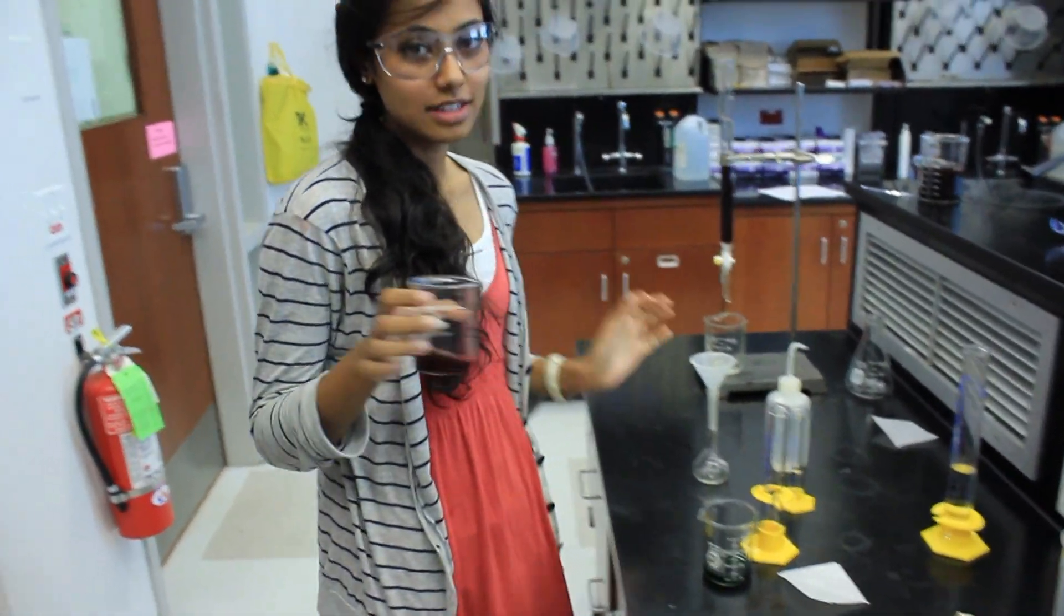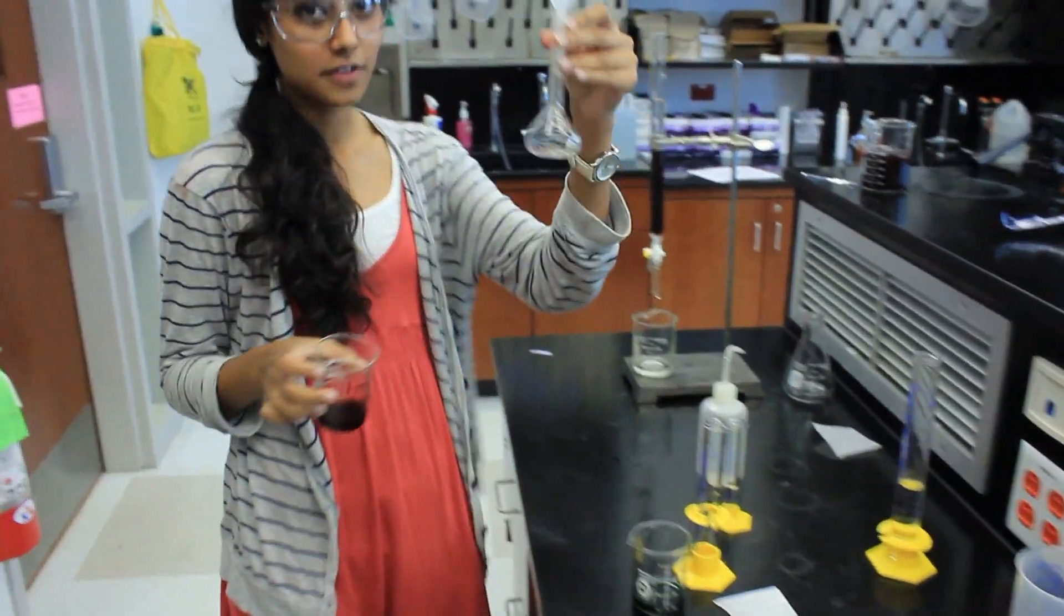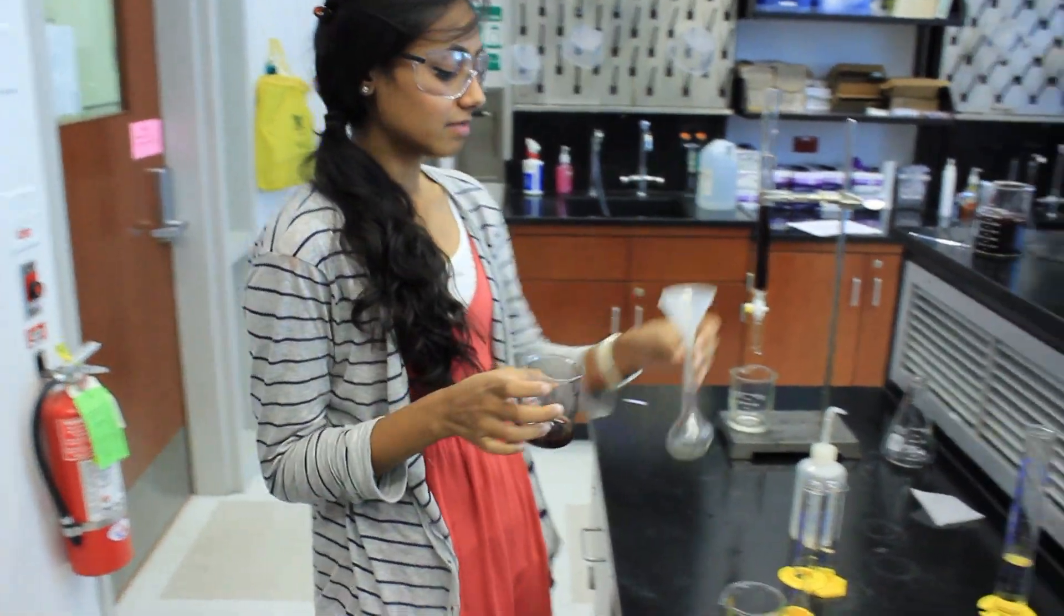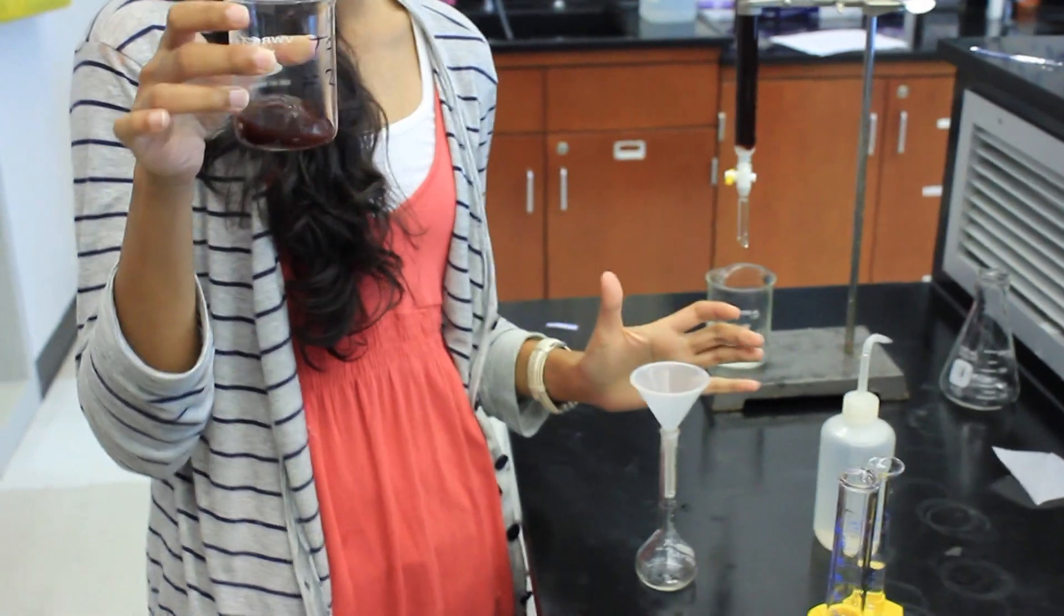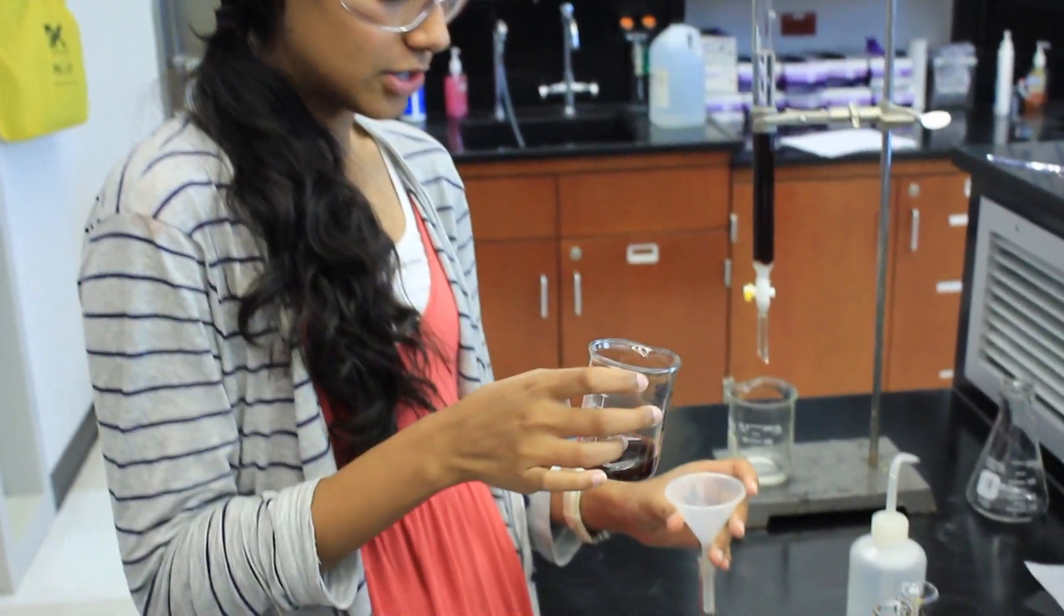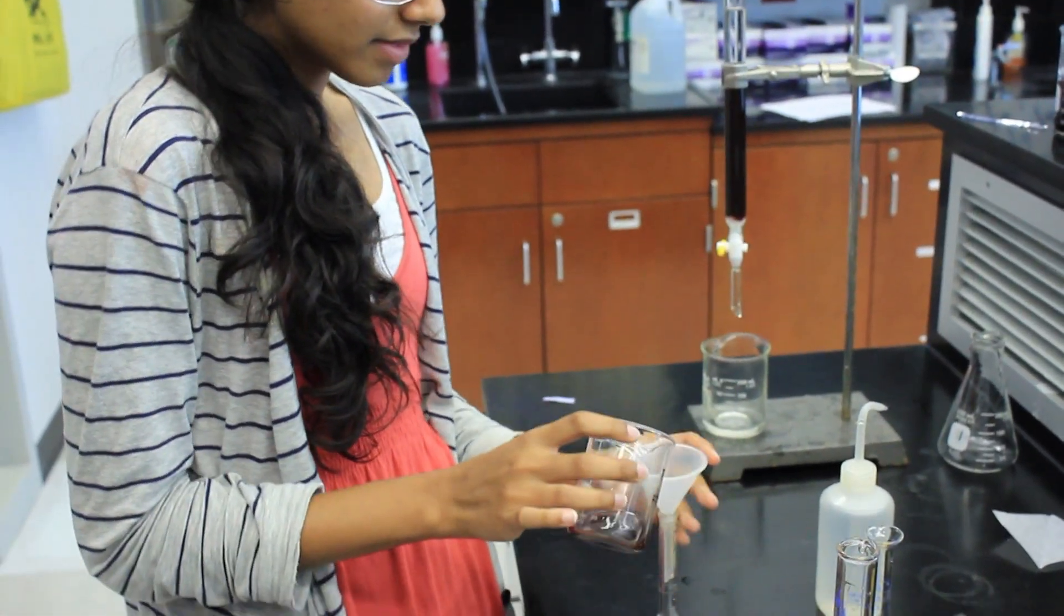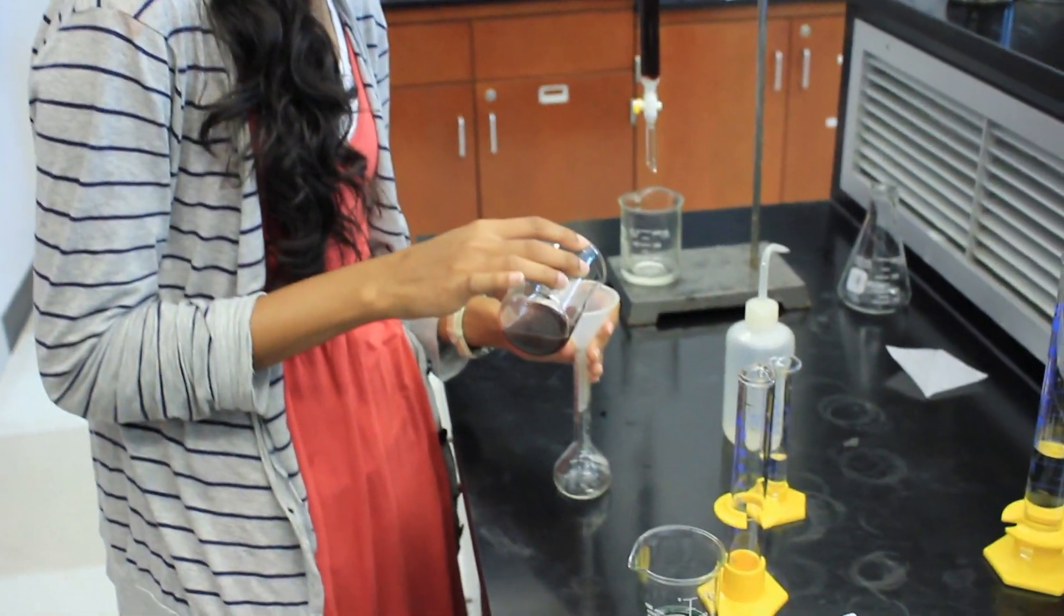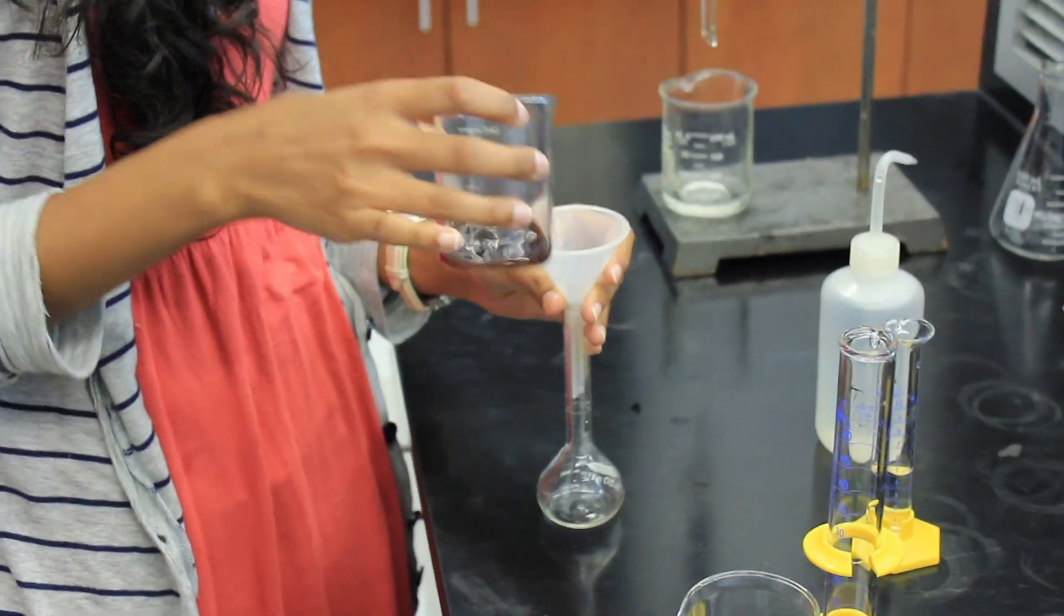Now we're going to pour this solution into your 50 milliliter volumetric flask. And make sure to not let any of the zinc get into the flask. Make sure to stir it up a little before you go.